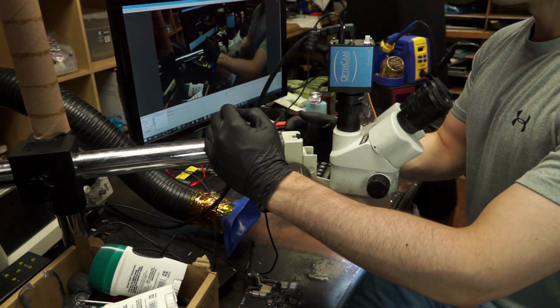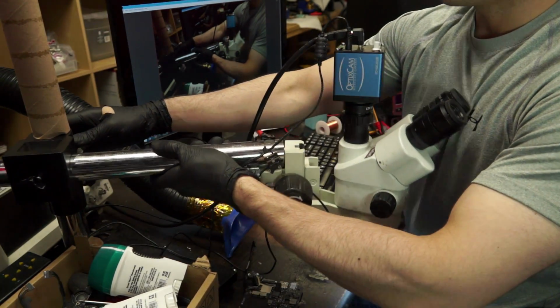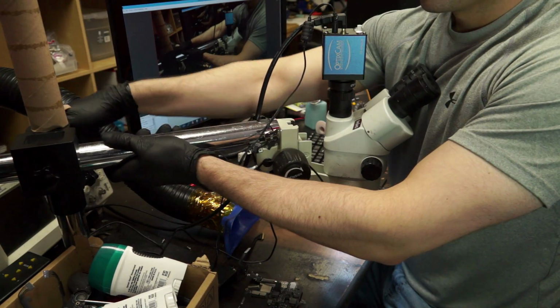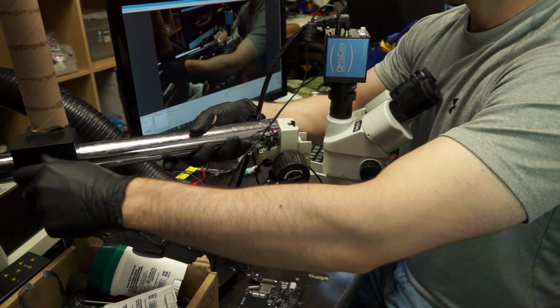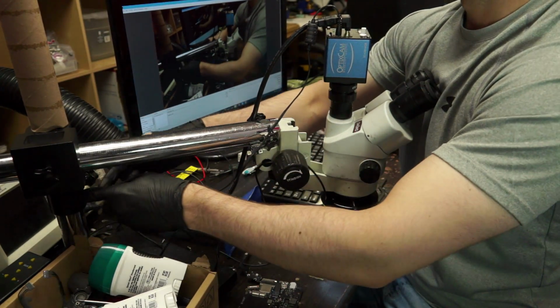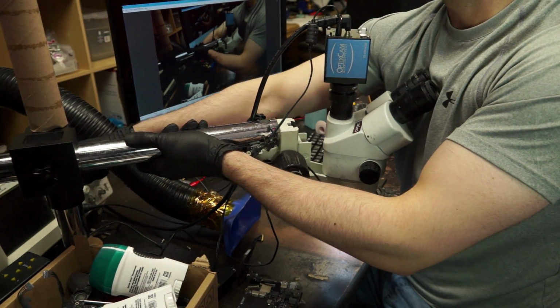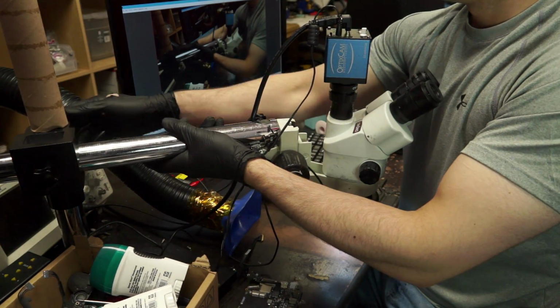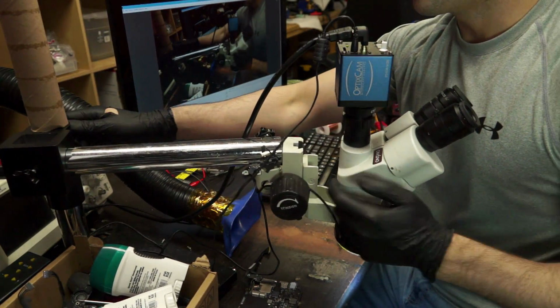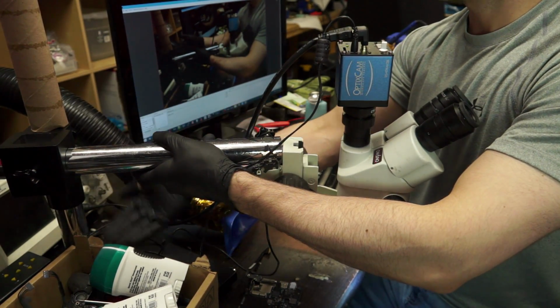This is the boom stand to my microscope, right? Now I have different adjustments over here to this boom stand. I have this one over here, which allows me to move it up and down, and also from side to side. Now there's also this one over here, which adjusts this thing, which allows the microscope to move like this. Now I'm very rarely doing anything with this. And then this one also comes with this thing over here. See this? This allows me to lock it in place. So what I can do here is I can lock this over here, which allows me to then loosen this so I can adjust it, I can move it left and right without worrying about the microscope falling all the way down. Because again, if I loosen this, the microscope is going to fall all the way down.